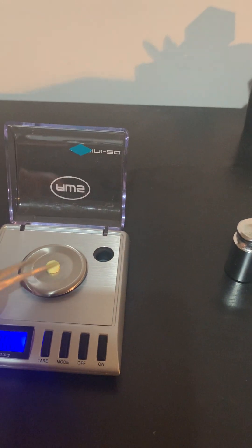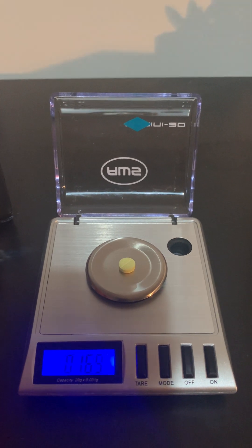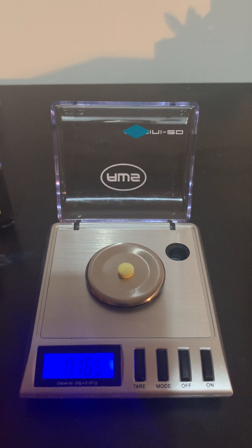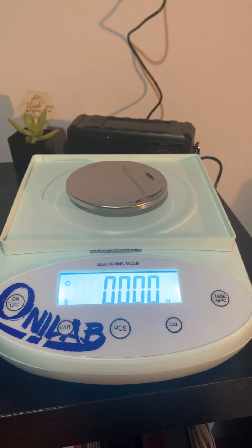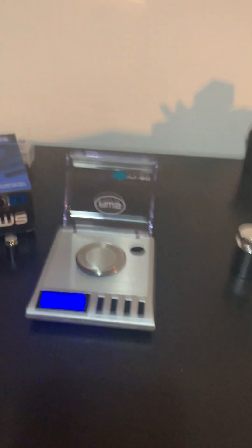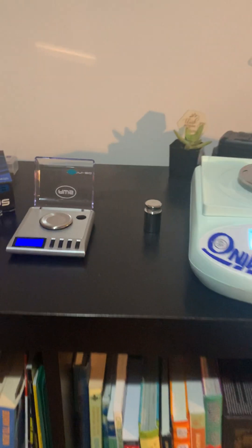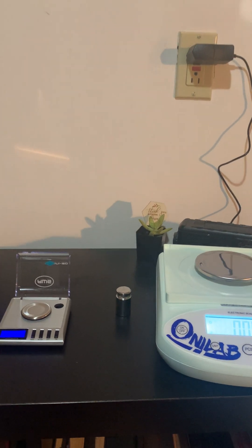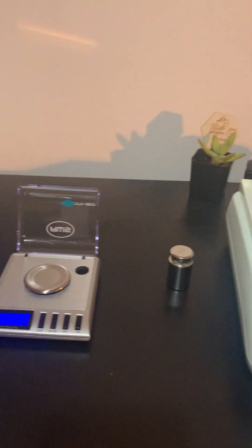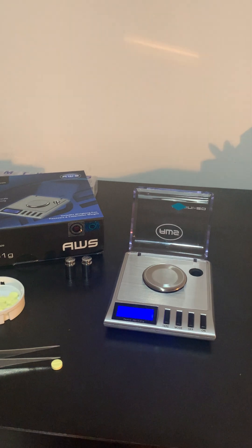I'm going to try the Gemini again — look at that. Based on this, I have a bit of concern with the Onilab and I'm going to return it. I'm going to keep using the Gemini 20 — it's been dependable, easy to put away, and as you can see the size difference is significant. Hope that was helpful, and if you have any questions, please feel free to ask in the comments below. Thanks.